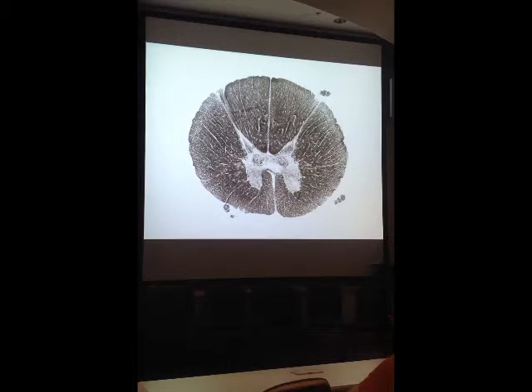On a really good slide of the lateral horn, it'll pouch out about like this. It'll just hang out like a little tip of a finger, the distal phalanx of a finger or something. It's usually much bigger, but this is the slide you put in the atlas. So the lateral horn is made up of a specific nucleus of lamina 7 called the intermediolateral nucleus, IML. If I ask you to name the specific nucleus that makes up the lateral horn in this region, it's the intermediolateral nucleus. I don't ask that question very often, but it could be asked on board exams, so I've asked you to learn that nucleus.